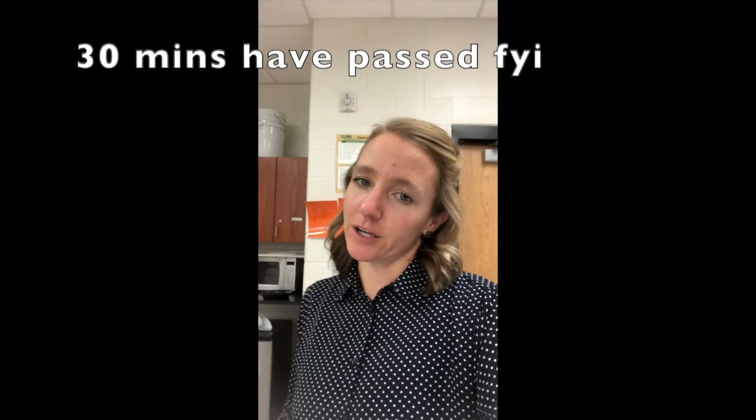Okay, so I think you got enough of that, but pretty much I'm just going to let the reaction keep going, shaking it off, let it grow until it stops, meaning hopefully we've used up whichever one is our limiting reactant. And then once the reaction is complete, I'm going to pull the wire out, let it dry, weigh it, if there is any wire left, and get our silver out, let that dry, and weigh that as well. So when I get those measurements, I'll add them to our data table.